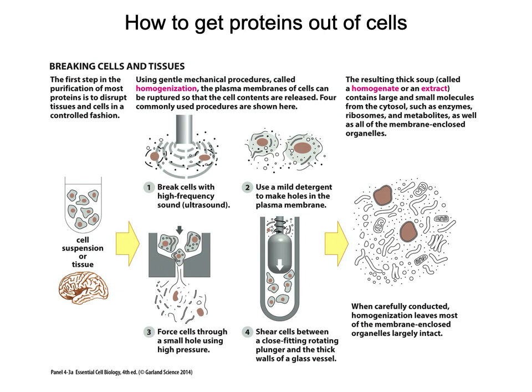So if you had a tissue, you could put it in a mortar and pestle. If anybody cooks, you might have a mortar and pestle where you grind herbs up to release the oils of the herbs and to break it down. So it's the same kind of idea where you're taking this mortar and pestle and grinding it. So you're grinding these cells.